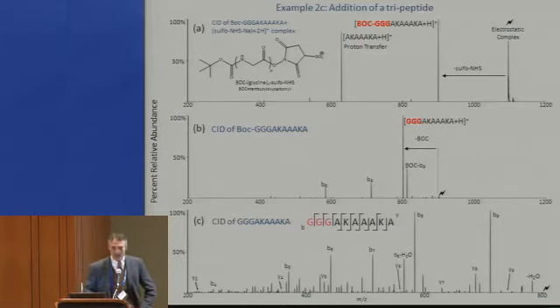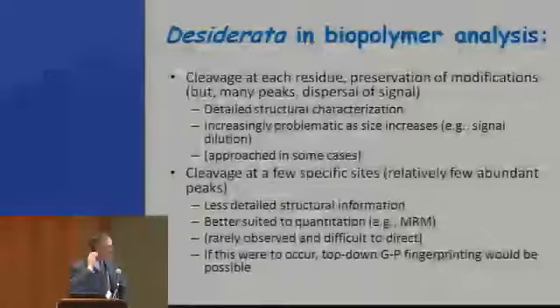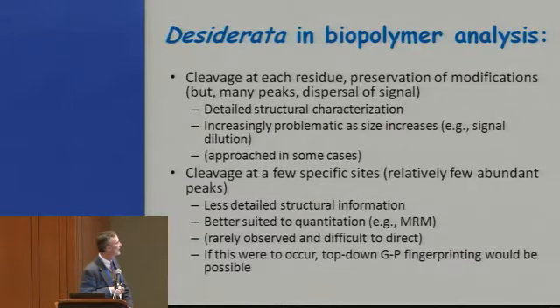So that experiment seems to work pretty well, and it's very nice that these protecting agents are mass spec cleavable, so that makes it convenient. Okay, so now I want to step back and talk a little bit about biopolymer analysis, and really along the same lines as the theme of Don's talk, and that's protein characterization.